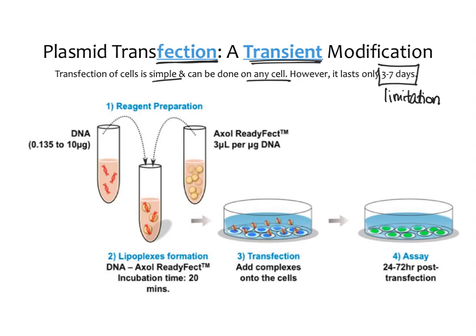And a transfection is really simple. All you're doing is you take your plasmid DNA. This is the plasmid that we just talked about. You take any transfection reagent. It doesn't have to be this one.